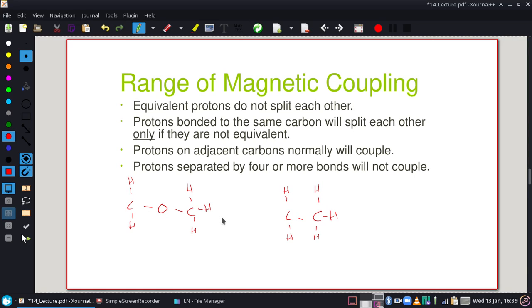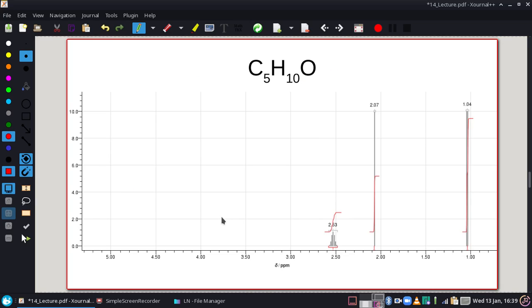It's going to help us actually identify structure as much as anything, because we get something like this happen. Notice how I have a split peak and I have a split peak. Since you need them to be adjacent, we know these two locations are adjacent to each other. And this one that's not split is not near these other two, because if it was near these, it would get split as well.